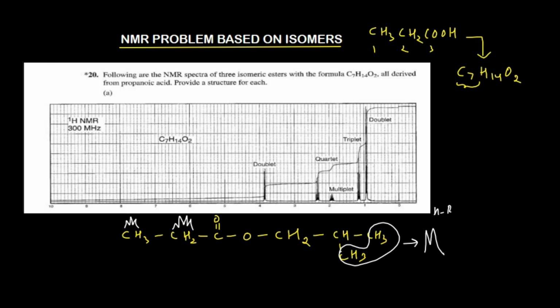And you see this hydrogen, which has 2 hydrogens on the left-hand side and 6 hydrogens on the right, so typical splitting will occur and they will have different values of the coupling constant because oxygen is here. So you will get a multiplet for this particular hydrogen: 1, 2, 3, 4, 5, 6 and kind of a multiplet.